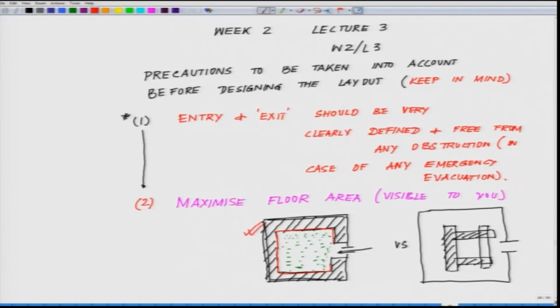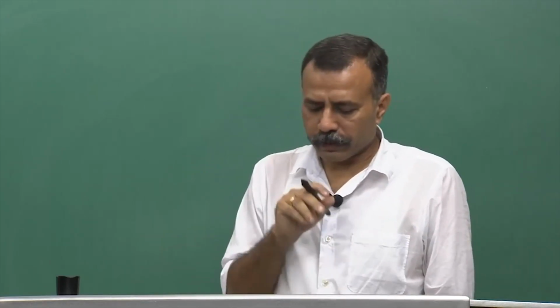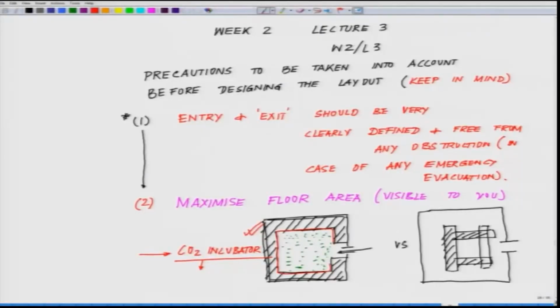Now, all the cell culture labs across the world use something called a CO2 incubator. We will come later to why you need it; that is where you need the incubator for maintaining the pH inside the culture dish. So, at this point, this is not important. Important is that to maintain a CO2 incubator, you need a supply of CO2 cylinders.